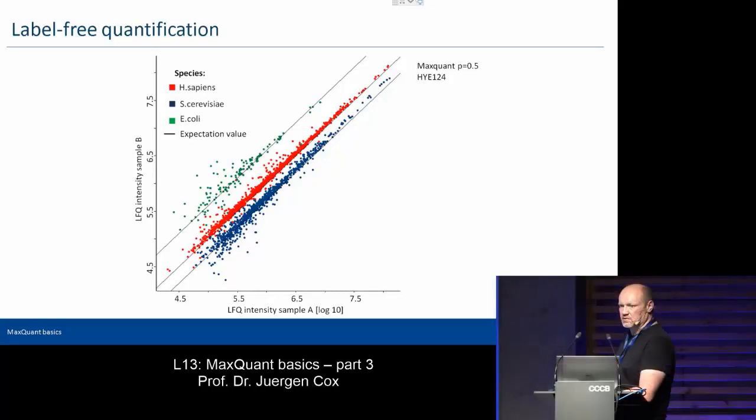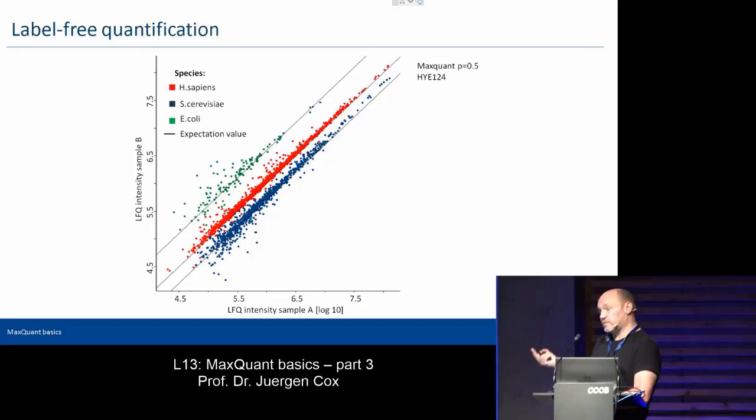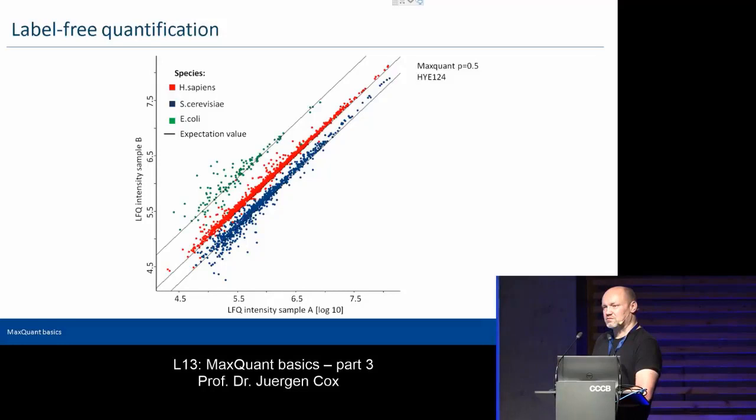Does MaxQuant in general work for Waters, Raphael? At the moment, not. We're working on the import, the plugin that reads the raw format from Waters. In principle, it works already now if you convert it. That would be the only format that would have to be converted from the vendor raw format to mzXML, for example. But this would be conventional DDA data, so MSE data would actually not work for now.